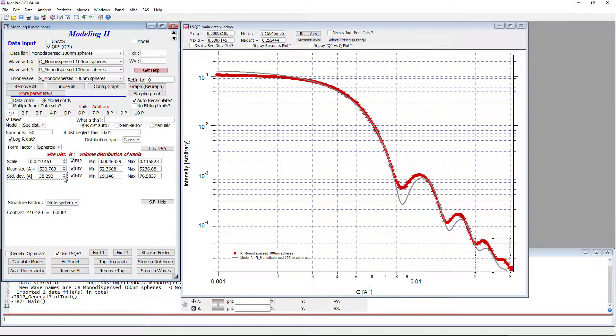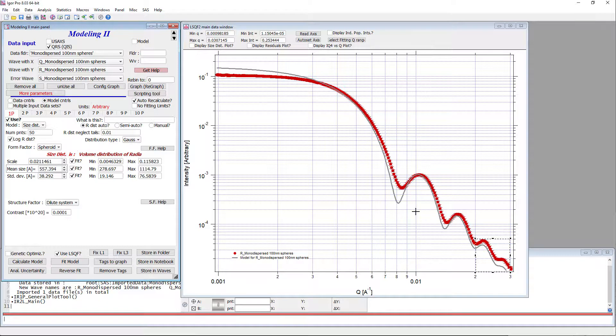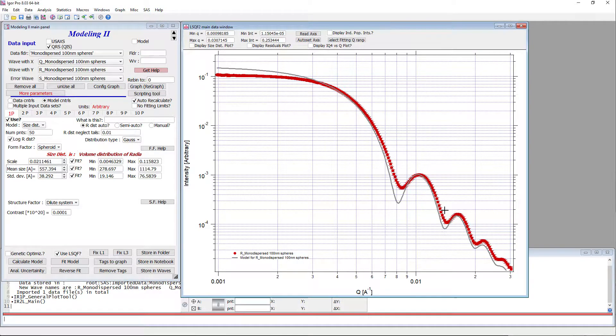Obviously there's more to this data set than it originally looked at. First thing is we need to make sure that these oscillations here don't wash out. And that washing out of high Q is controlled by the width of the standard of the size distribution. So let's just go and make it narrower. By now they're approximately right. Now we're a little bit too small. So we can go a little bit larger. And we see that they are getting reasonable. You can see that there is this one is matching. This one is nearly matching. This one is lower. And that's one even lower.